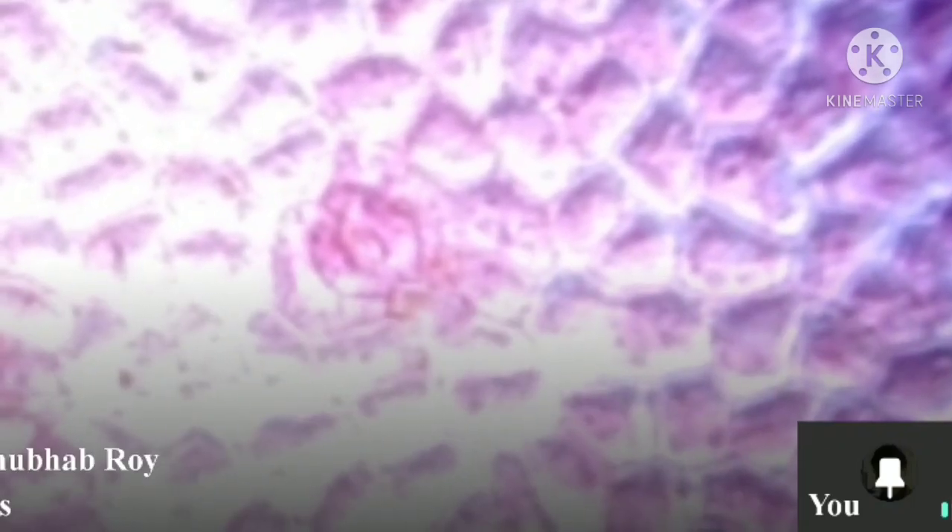You can see some other subsidiary cells around the stomata. The number of stomata is less in this area, and the distribution is not the same on all sides. No matter — if we can see one, it is okay. This practical you have to do inside the lab when you get the chance, but before that you can at least see what this type of structure looks like under a microscope.